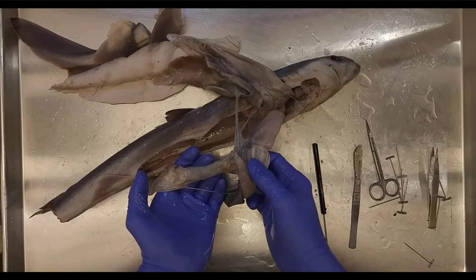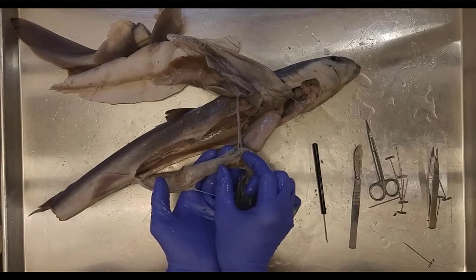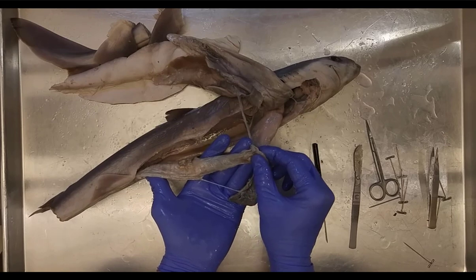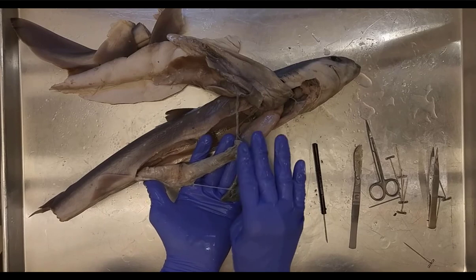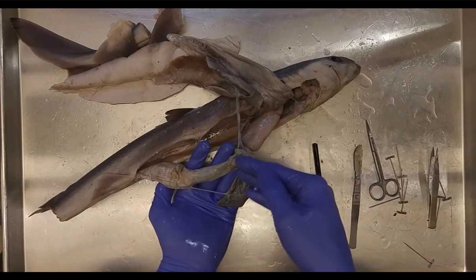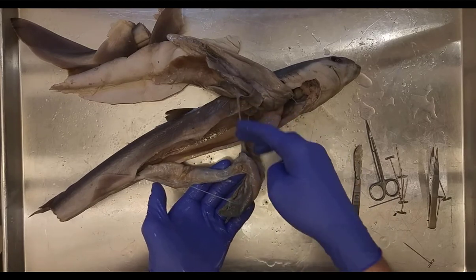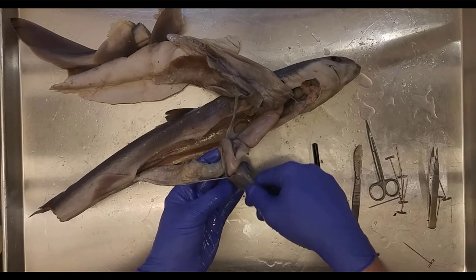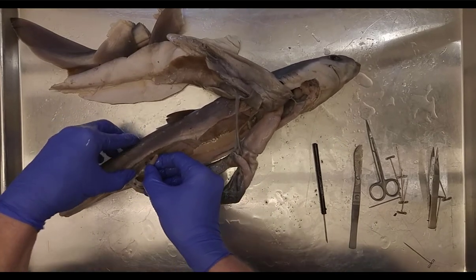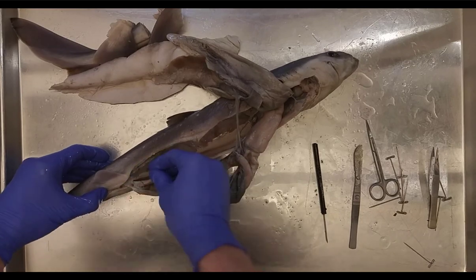Moving through the digestive system: the stomach leads via the pyloric sphincter to the duodenum — the first part of the intestine — and then to the ileum. The pancreas lies on top of the duodenum. The bile ducts, gallbladder, spleen, and pancreas all send digestive materials to the duodenum. Most nutrient absorption occurs in the ileum. Way back here we have the rectal gland, which is used for osmoregulation — regulating ion levels.